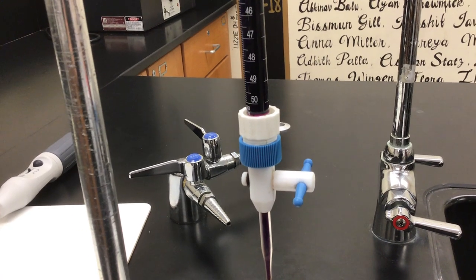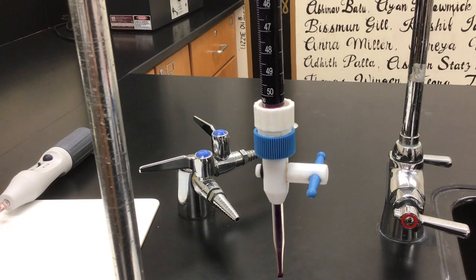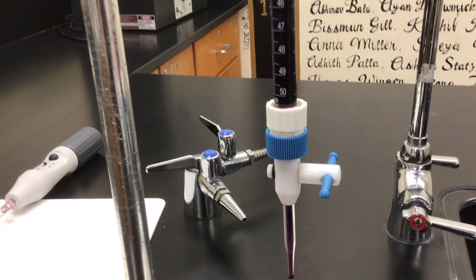So usually we pour things out of the top, because the burette adds things from the bottom. The numbers are turned upside down.